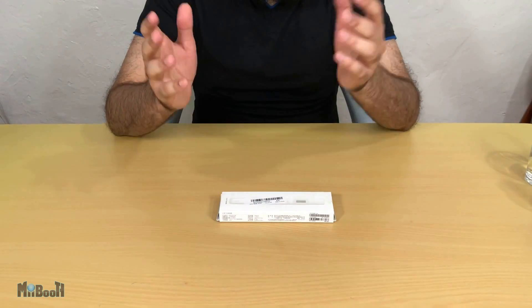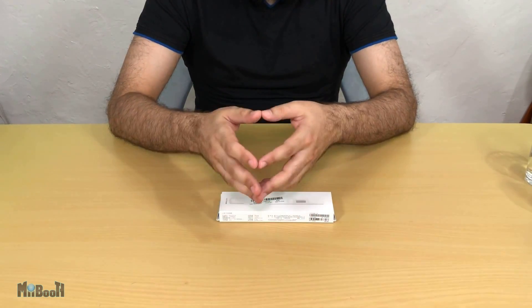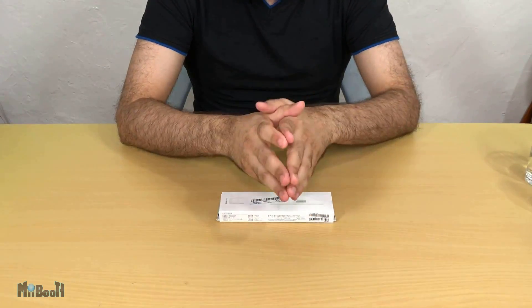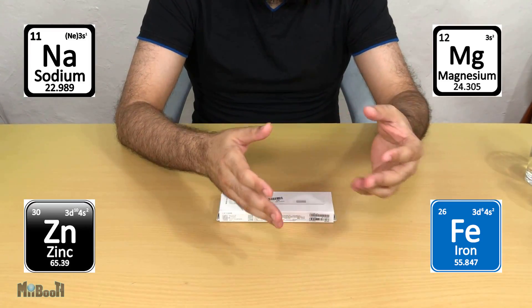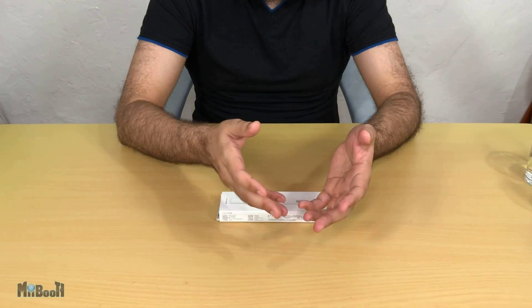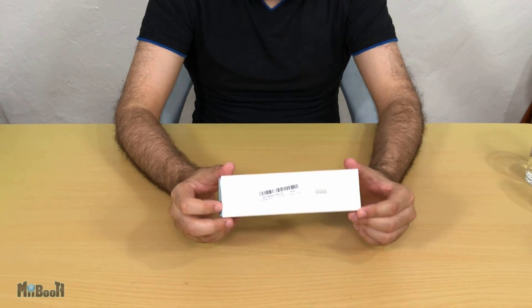These dissolved solids can be picked up from their source — for example, a spring running through rocks with high salt and mineral content underground — or picked up along the way to your house through distribution, plumbing, and runoffs. Some of these are important for the human body when consumed in the right quantity, like sodium, zinc, magnesium, and iron. However, in excess they can be dangerous, and sometimes harmful materials like lead and arsenic can also slip into the water stream. The TDS test is a simple way to check the general quality of the water.